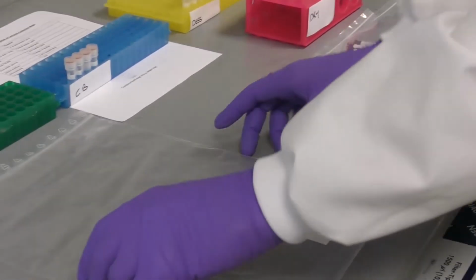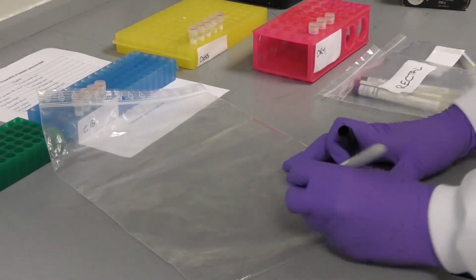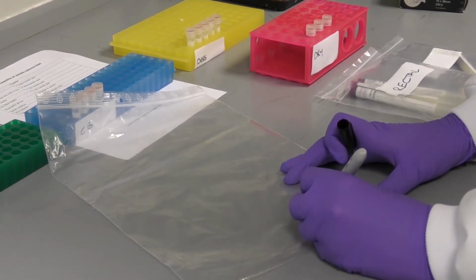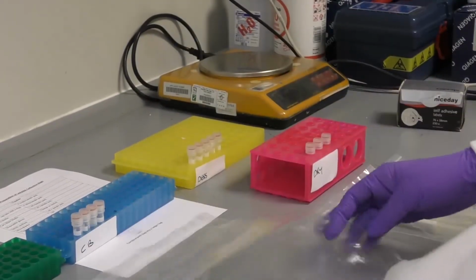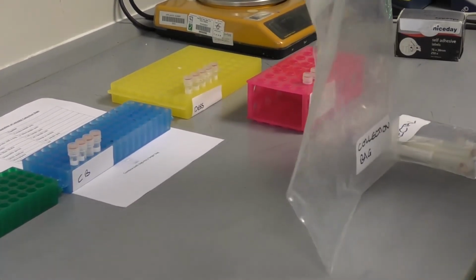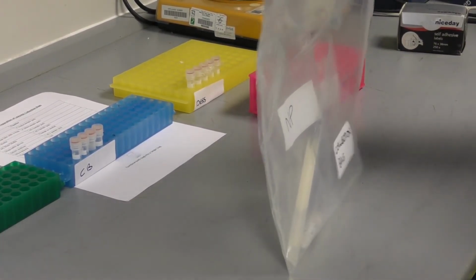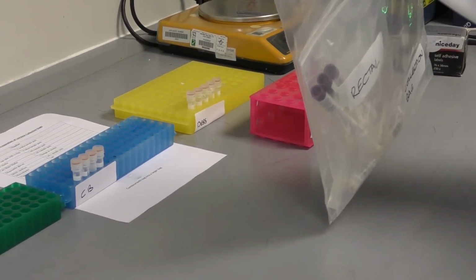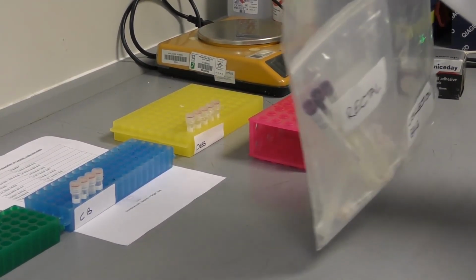We will then assemble the total sample collection bag. Place a blank sticker on the large Ziploc bag and label collection bag. Place your labelled NP and rectal collection bags into the large collection bag, making sure that all vials are labelled and within expiration date as previously stated. The collection bag is then ready to be stored at 2 to 8 degrees in the fridge and can be sent out to CS Coms and from there to the villages.